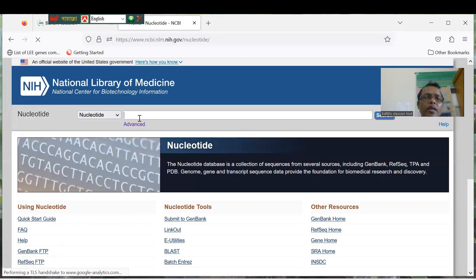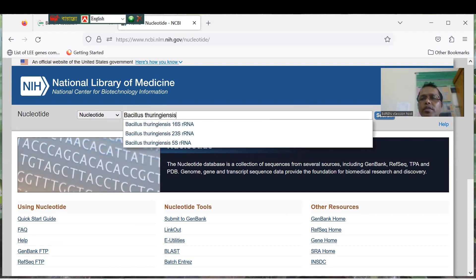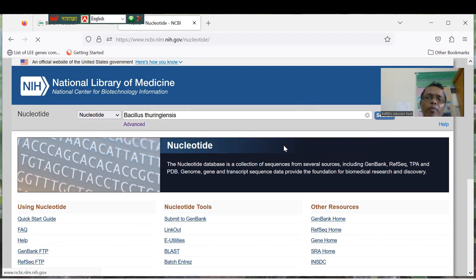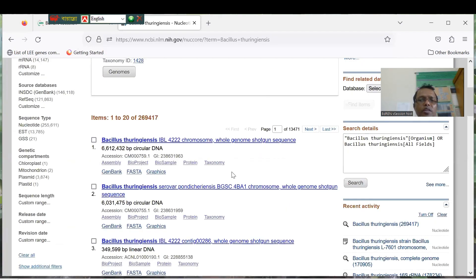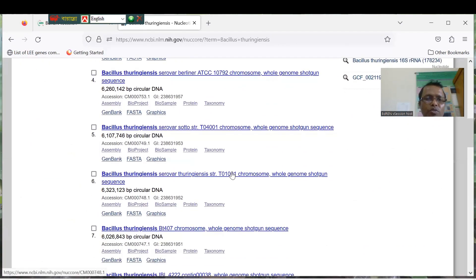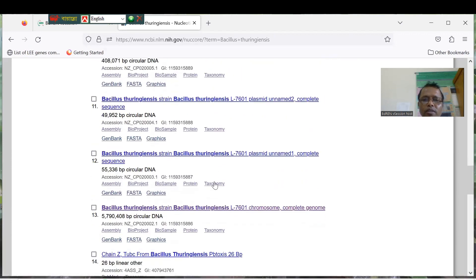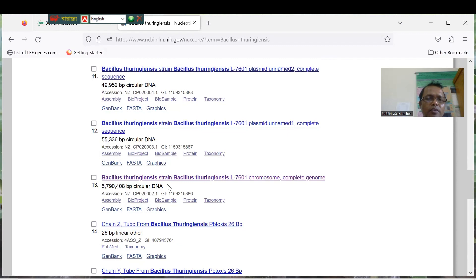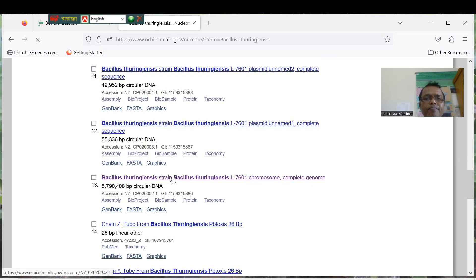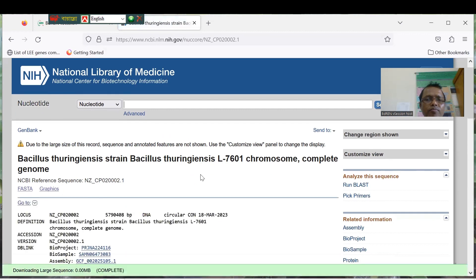On the NCBI Nucleotide home page, you can write the name of your bacteria — for example, Bacillus thuringiensis. There are many Bacillus thuringiensis entries here. I would like to take the complete genome sequence, which is a circular sequence. Look for the complete genome sequence of Bacillus thuringiensis — this one is 5.7 megabase pairs. Just click on it and wait a few seconds.